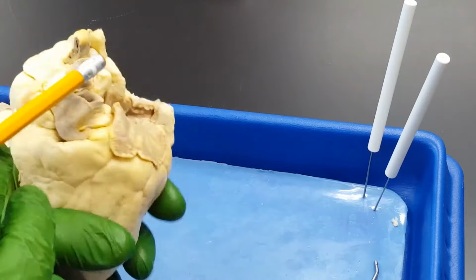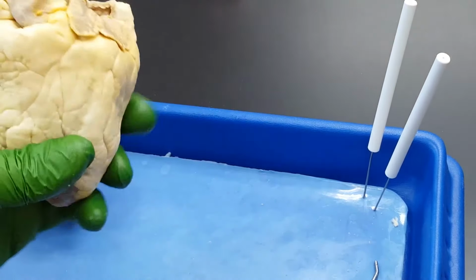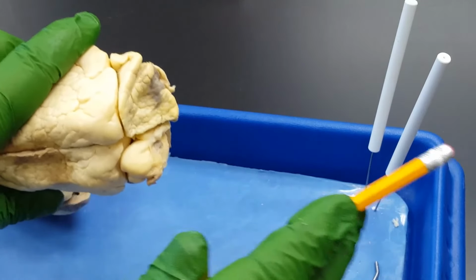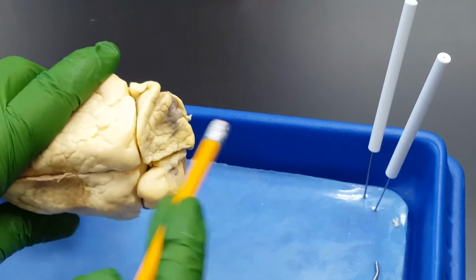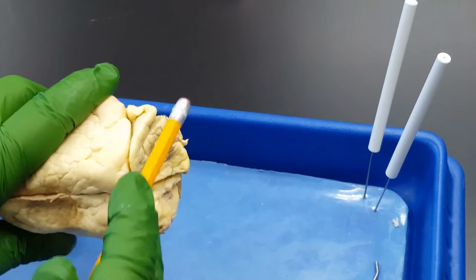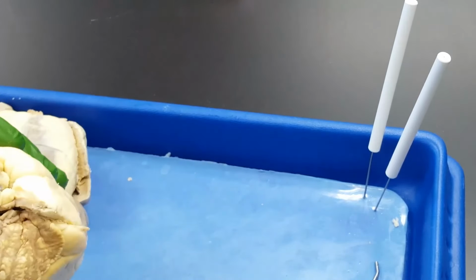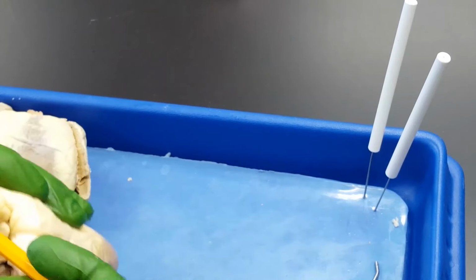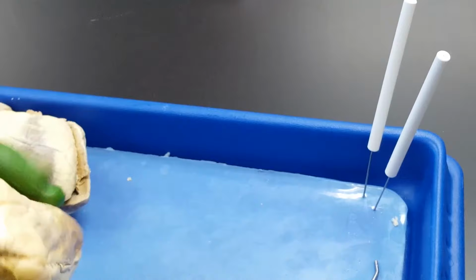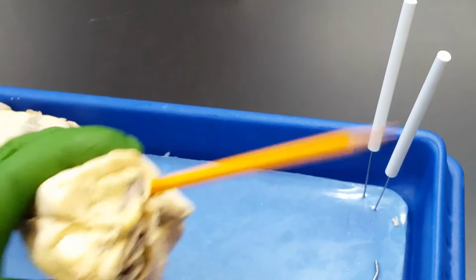There's not really a superior and an inferior, and believe it or not, the sheep doesn't have one because the sheep is out in the pasture. Head would be over here, tail's over there. It actually has an anterior and a posterior vena cava that come in, and then they cut it off as soon as they sort of merge into just one great big vena cava. So we don't have an anterior and posterior vena cava on most sheep hearts. We just have the two of them together.